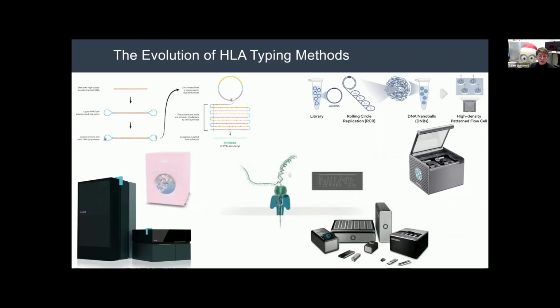So then we move into, or start to move into, third generation long read sequencing. More recently, third generation platforms such as PacBio, which recently came out with this hot pink version, which I quite like, and Oxford Nanopore have enabled sequencing of long amplicons or captured regions, spanning entire HLA genes, and in some formats, multi-gene haplotypes. Single molecule long read data directly resolves phasing across distant polymorphisms and structural variants, and it can address residual ambiguities left by short read methods and clarify complex alleles.